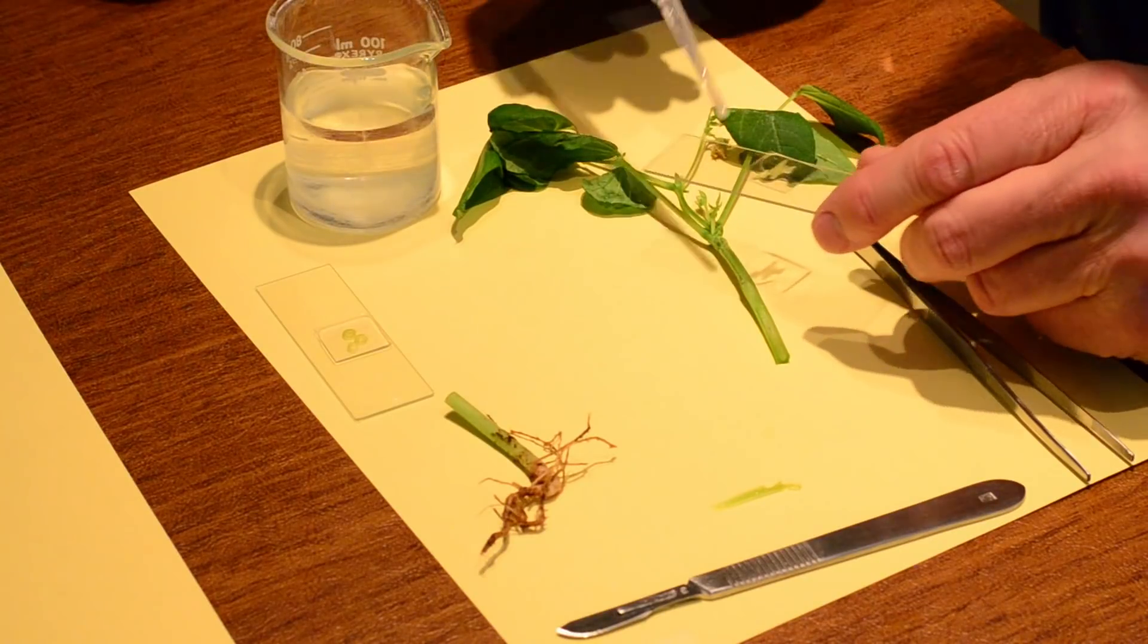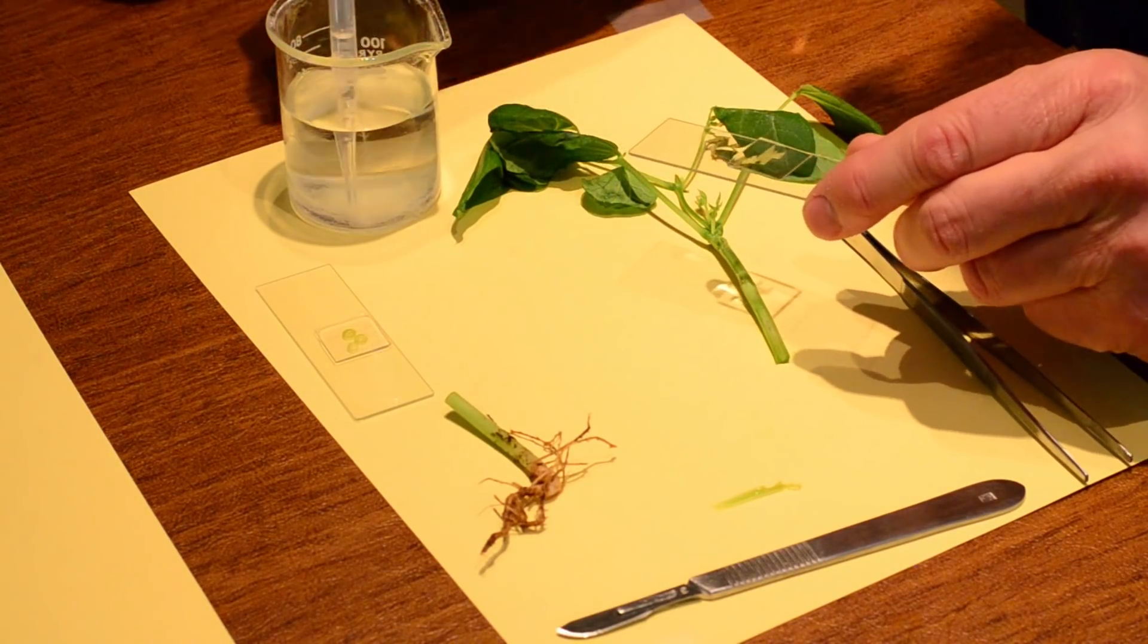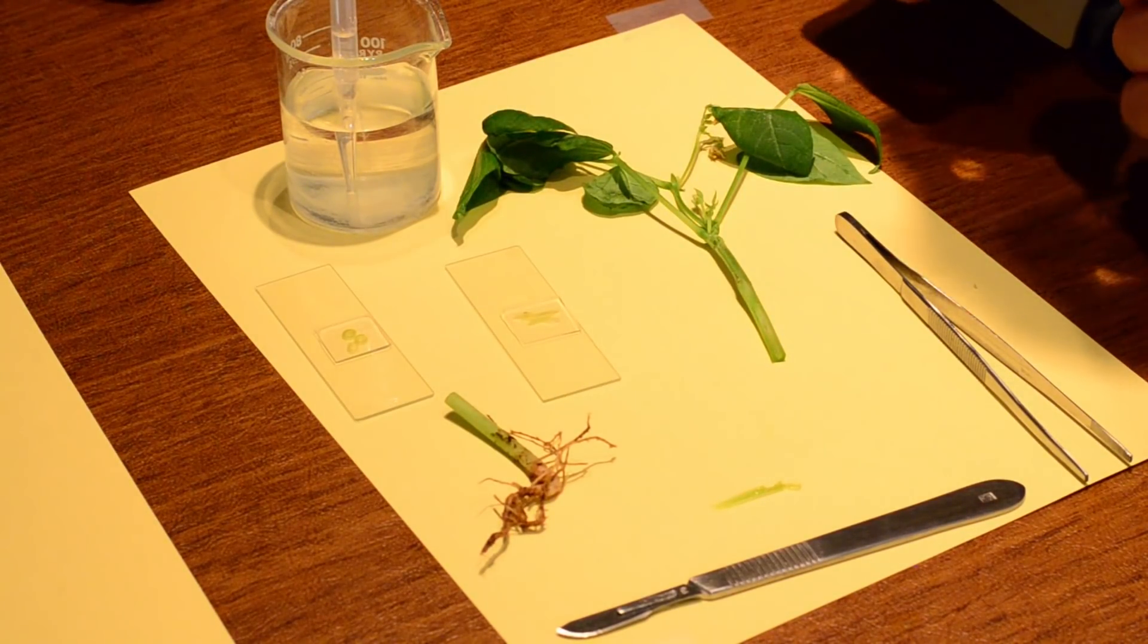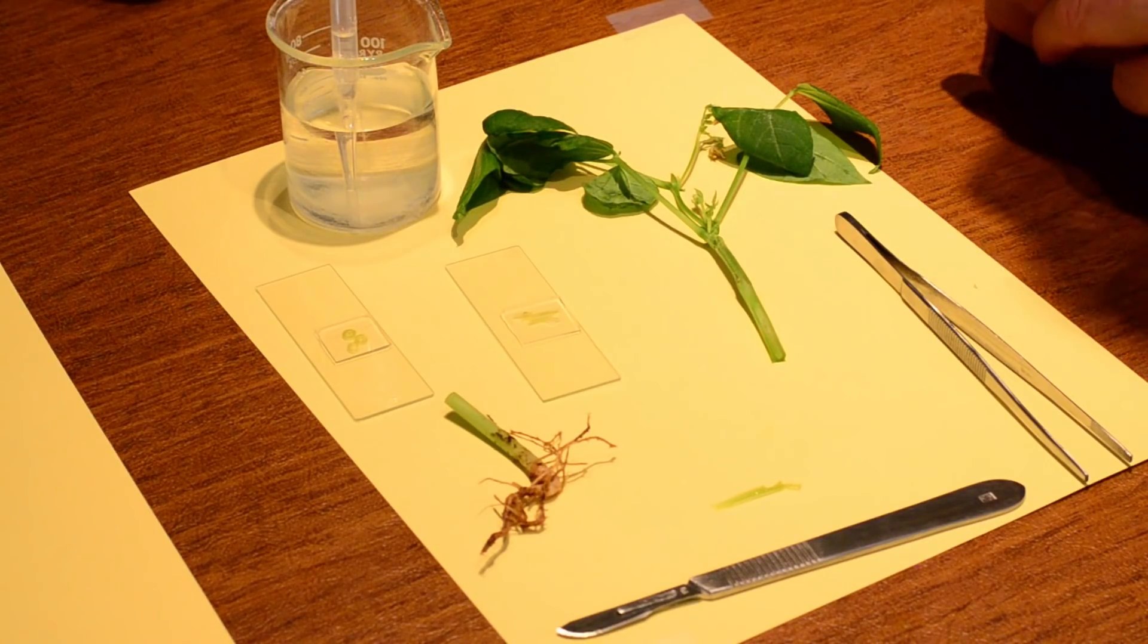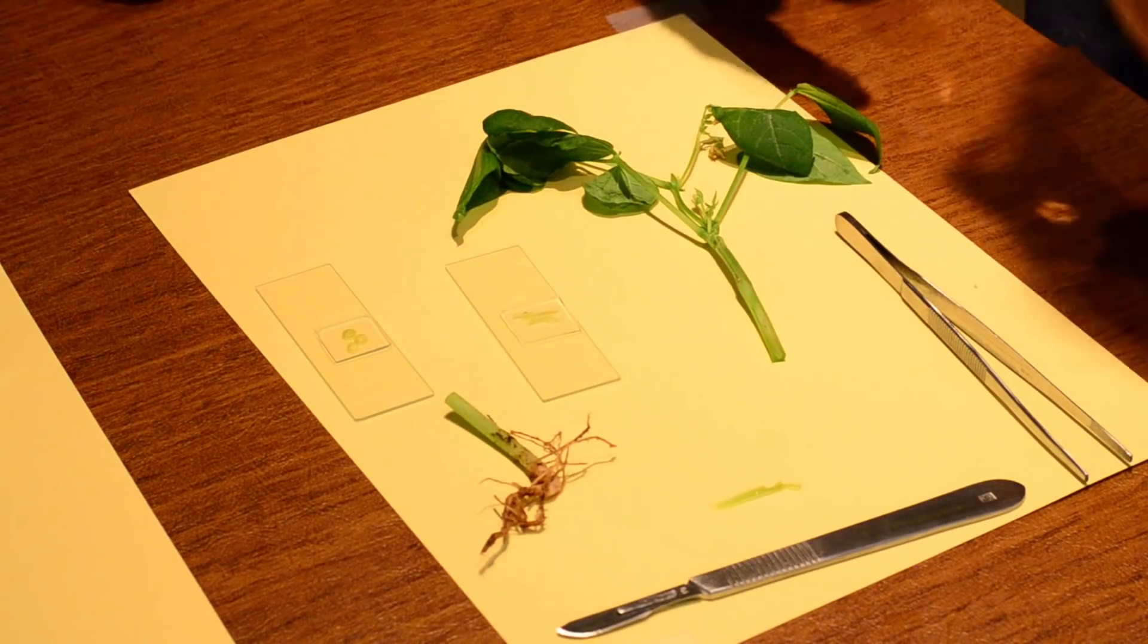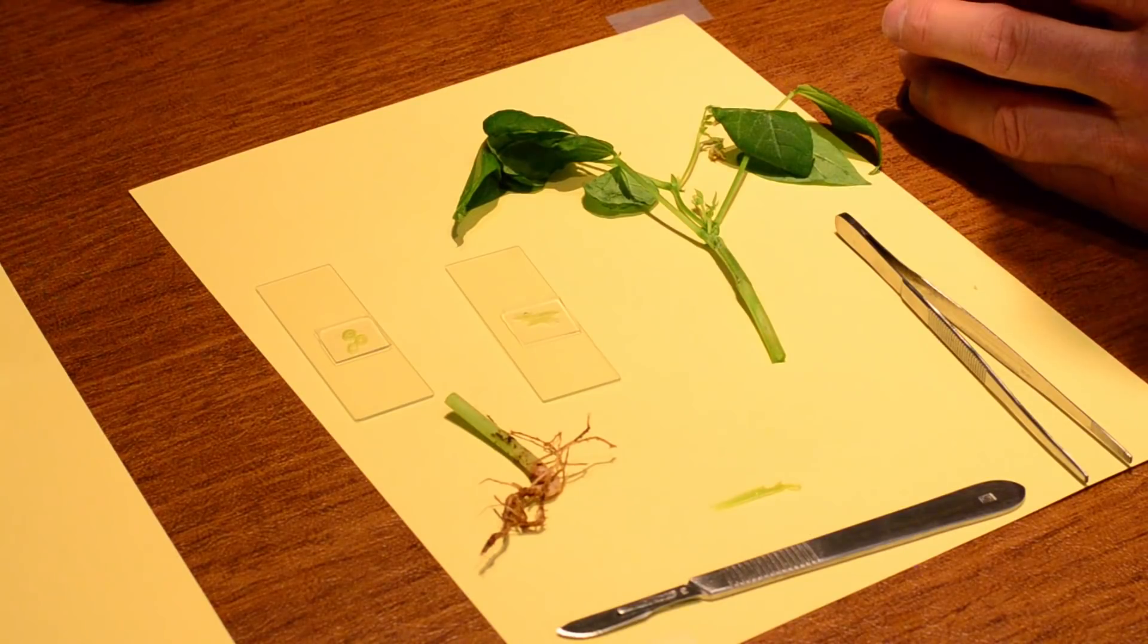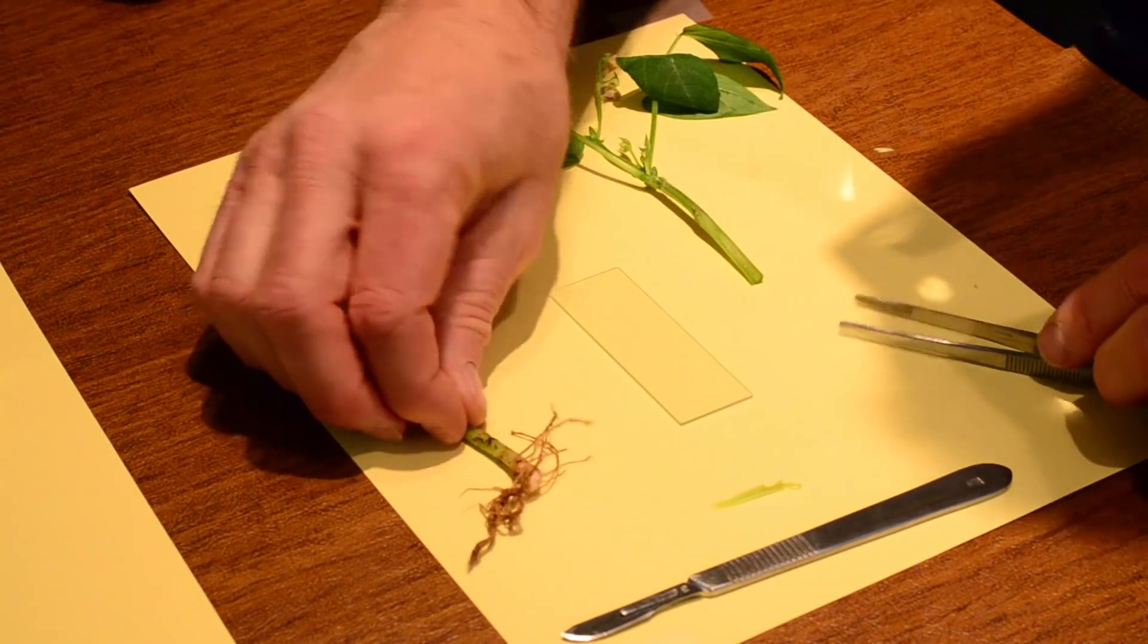We'll take turns doing this in class so everyone gets a chance that wants to. So now I have two slides, right? So I have a cross section and a longitudinal section. The next thing we do is we want to take a look at the roots. And so to get the roots, it's easy. We don't necessarily need to use the scalpel when we get root samples.